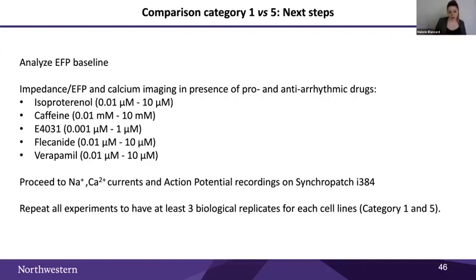Then the next system that is ready to be used is the SyncroPatch, the automated patch clamp.